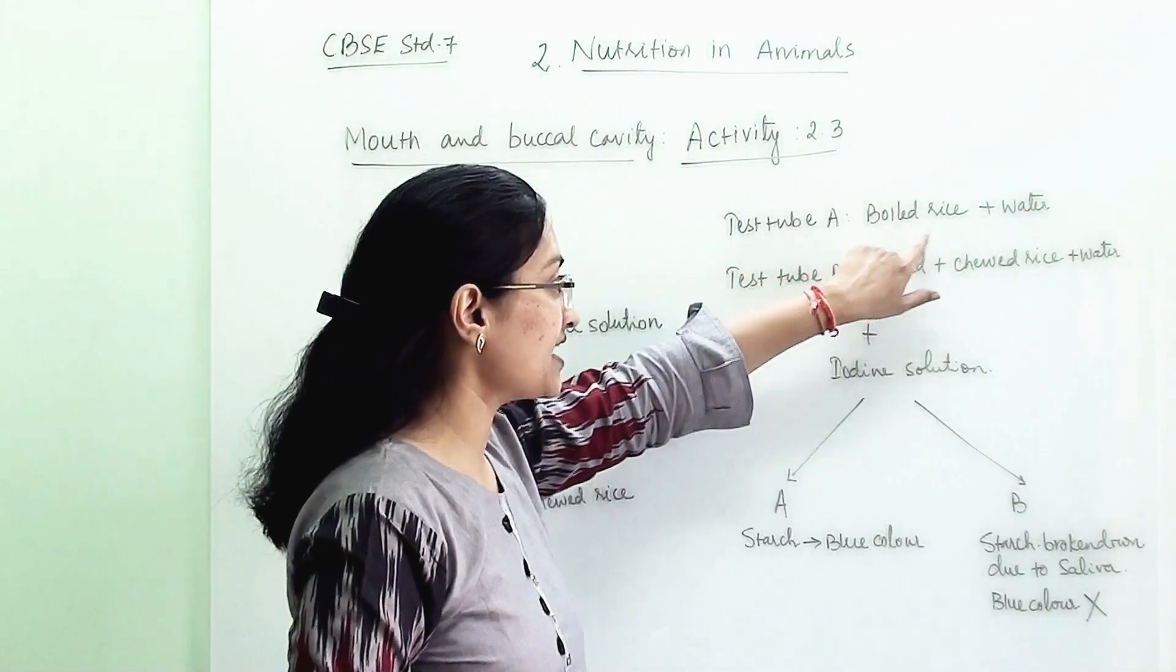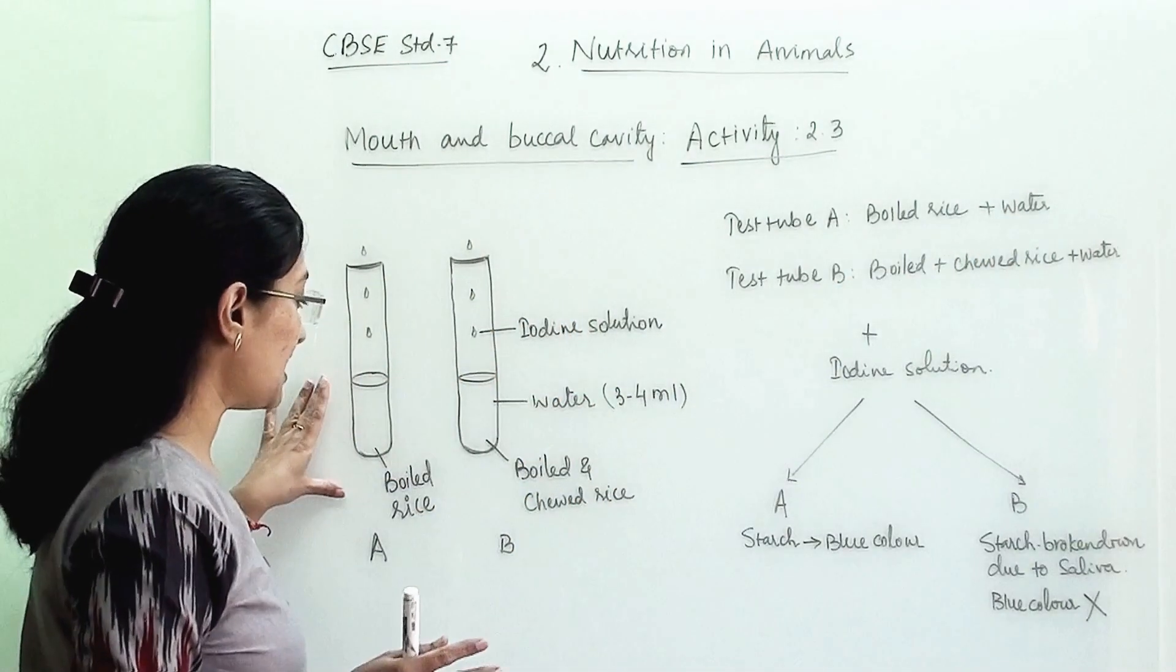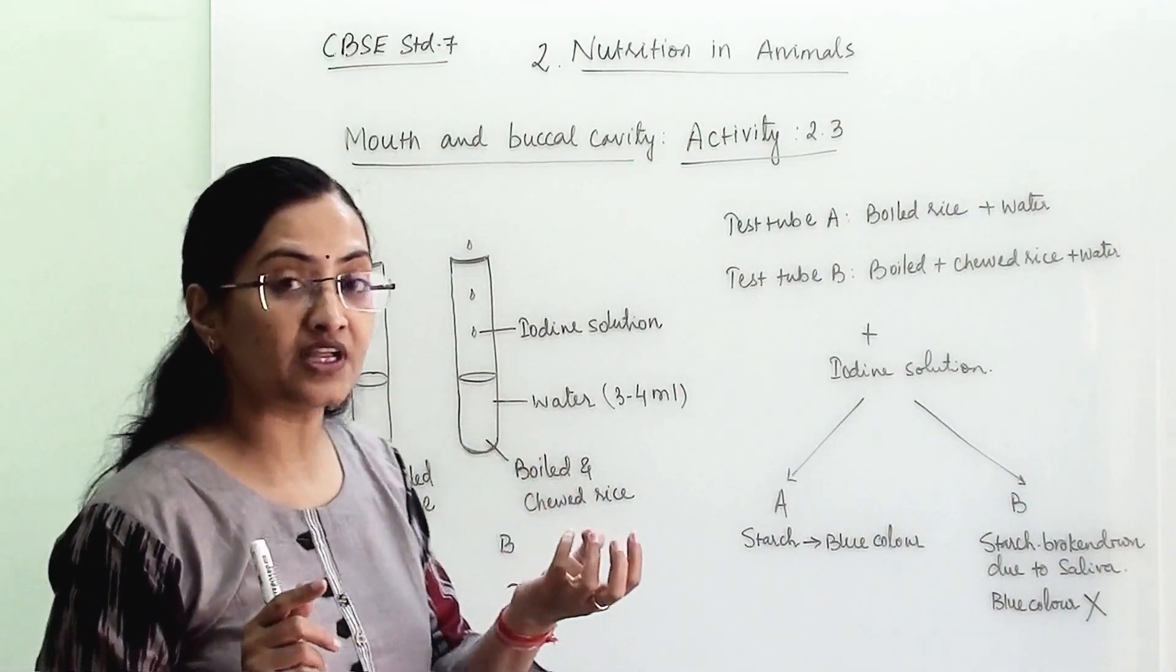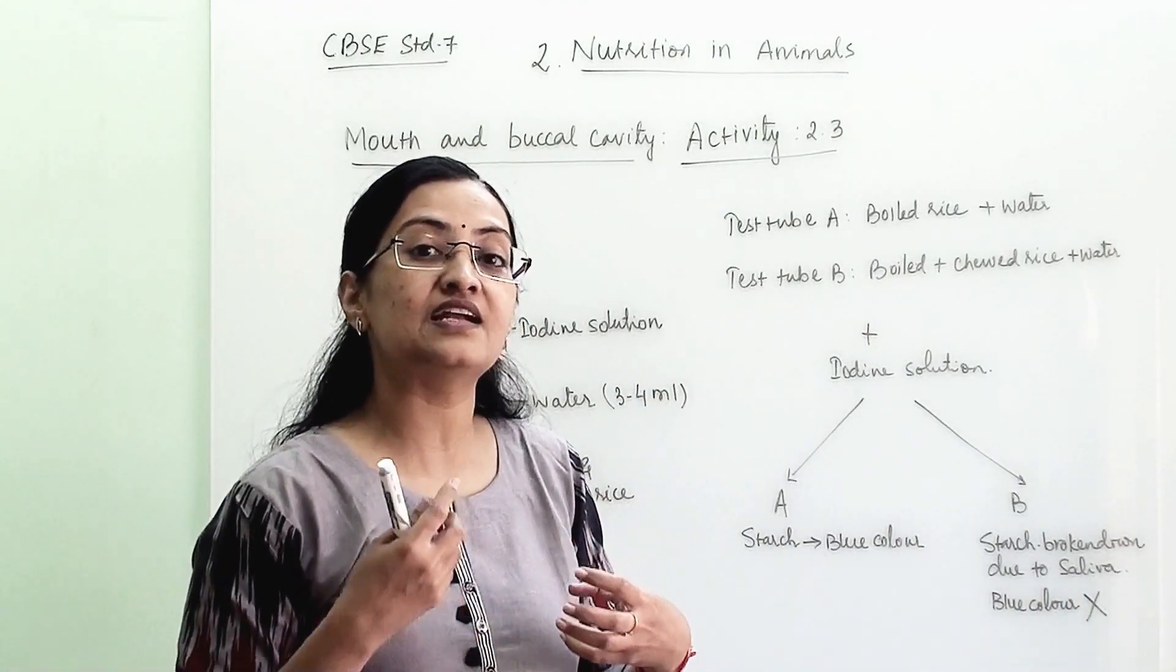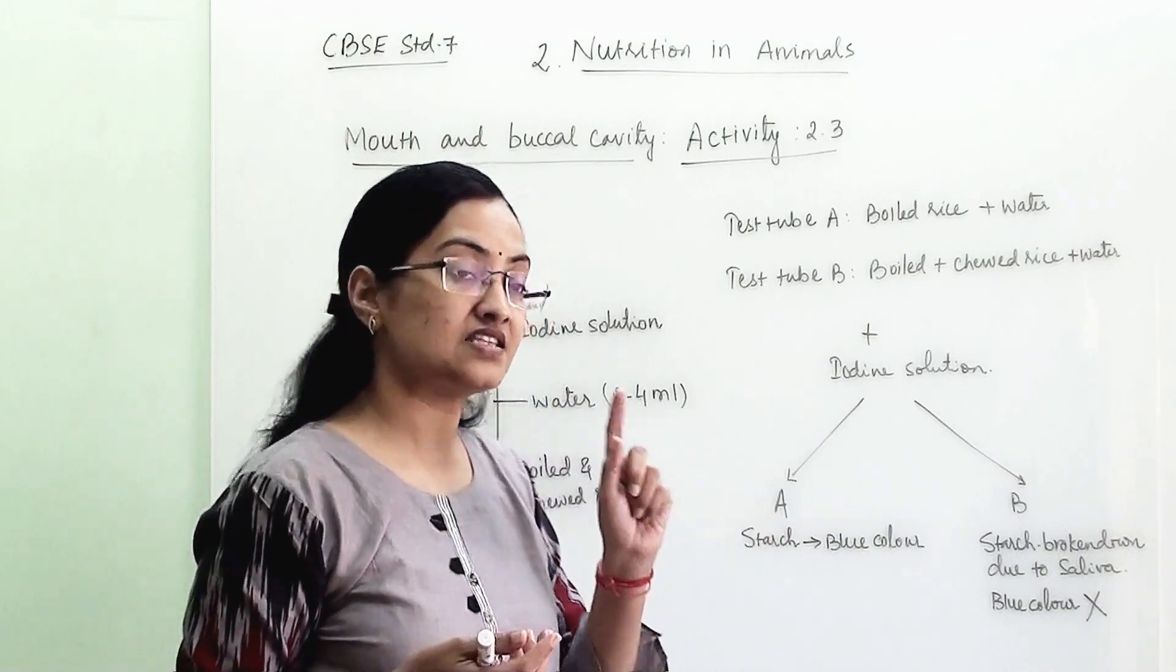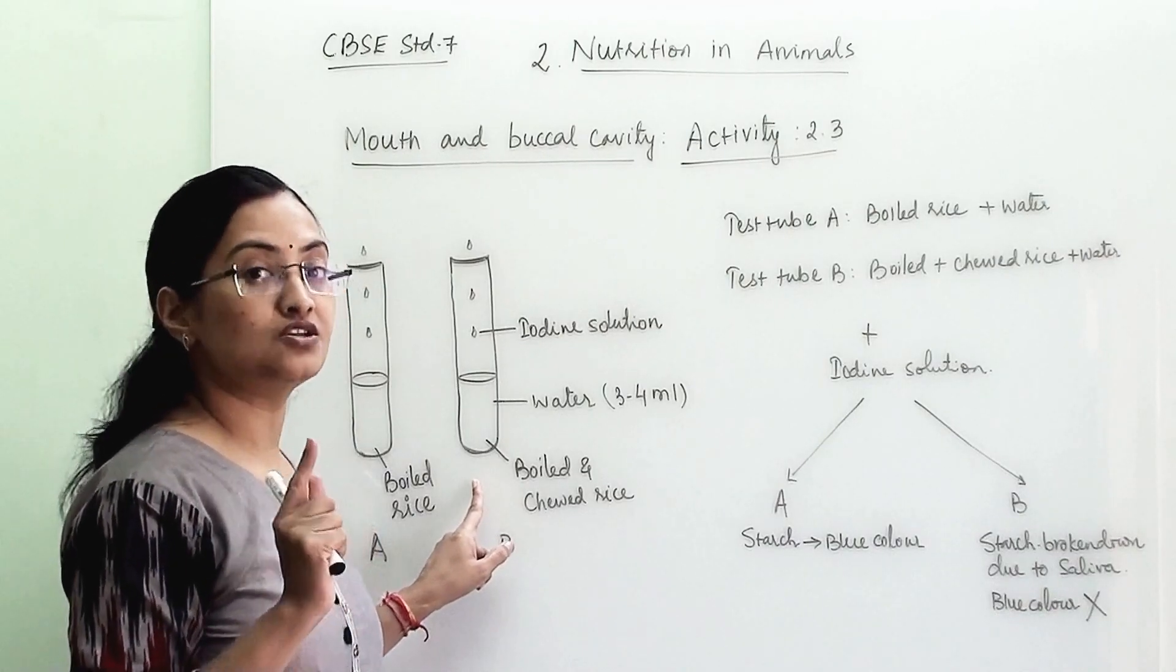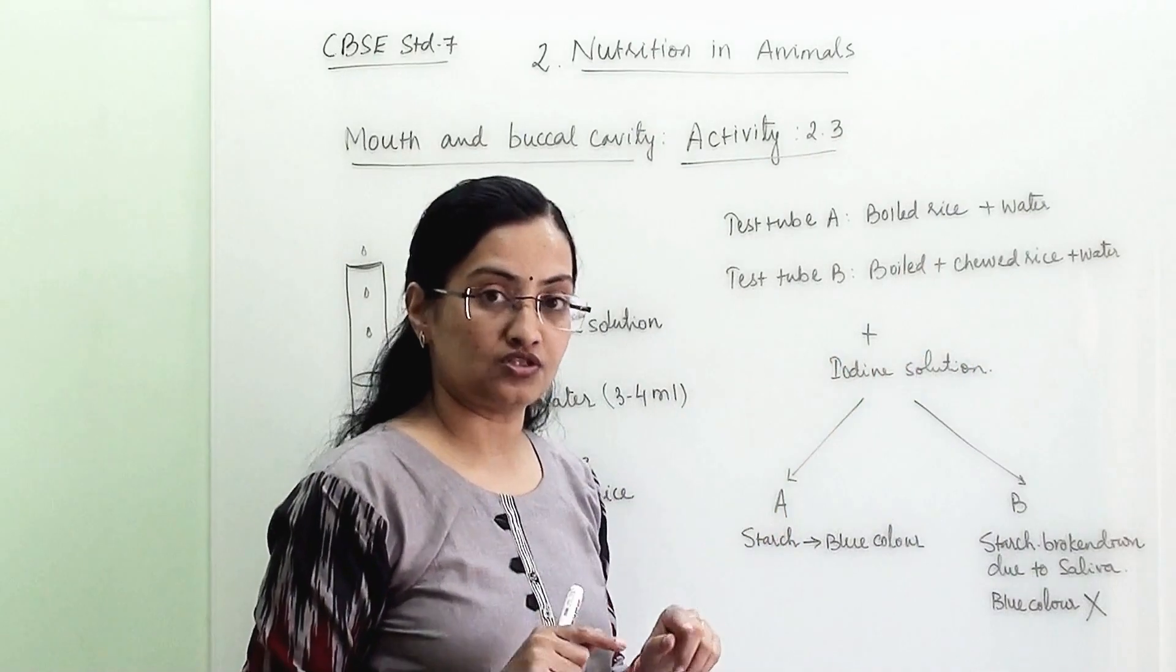In test tube 1, we have taken boiled rice and 3 to 4 ml of water. Into another test tube, we have taken boiled rice but before taking that, we are chewing it a little bit so that our saliva will get mixed with it. After that we are taking out that rice and putting it into this test tube, which has saliva mixed into it, and we are adding 3 to 4 ml of water.